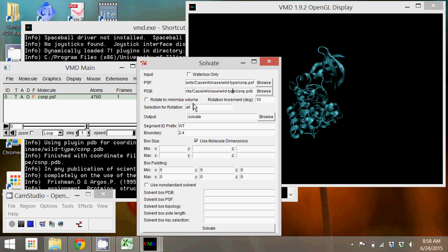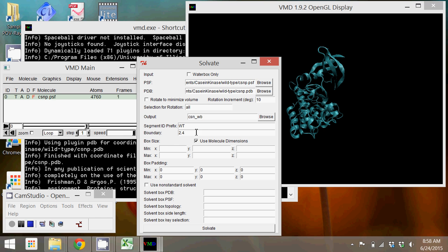I'm going to call it CSN underscore WB, standing for casein kinase water box for WB. The boundary here, you can skip the segment ID. It's not important for this.